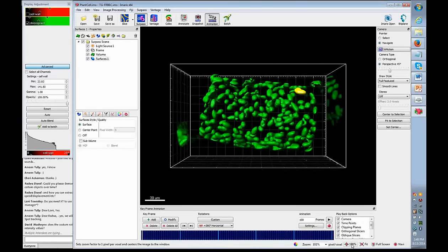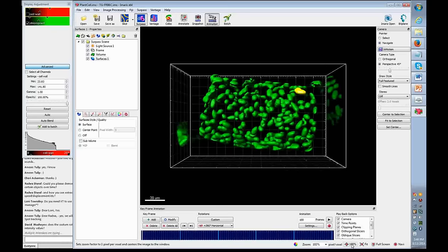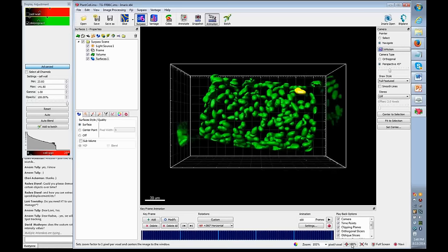So if we step that down to 10 microns and move through, we can pretty easily spot that there's a fast mover in this region of the image, and it's probably jumping between 10 and 15 microns based on that grid spacing. Autoregressive motion does tolerate some variation or some exceeding the maximum distance, and the larger we make it, we will be somewhat more error prone. So I don't want to go too far with it. Maybe we'll do 12 microns.